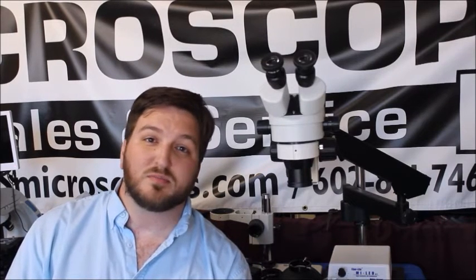When your microscope focus loses tension it can be really irritating but luckily it's usually a pretty simple adjustment to get you right back up and running again.